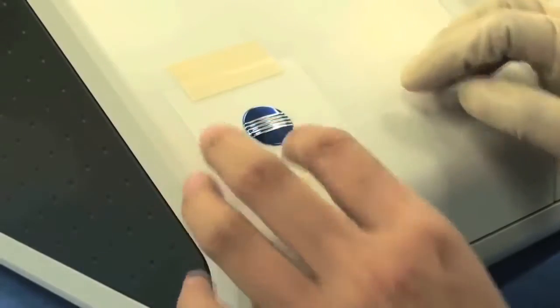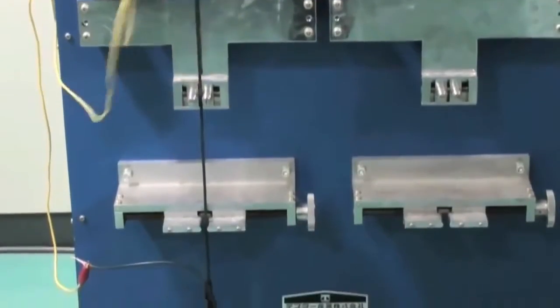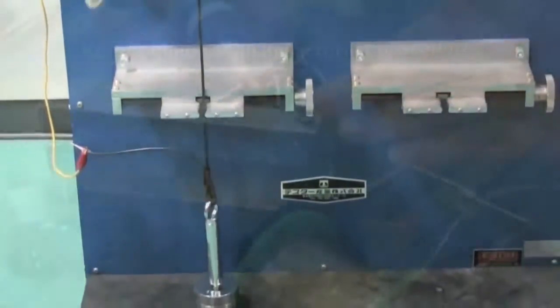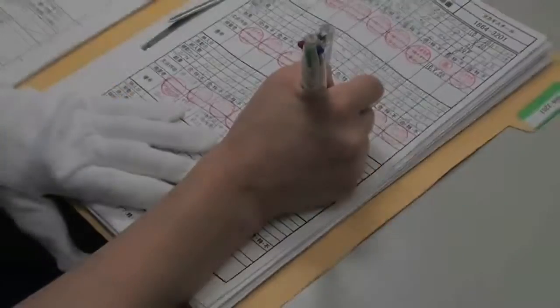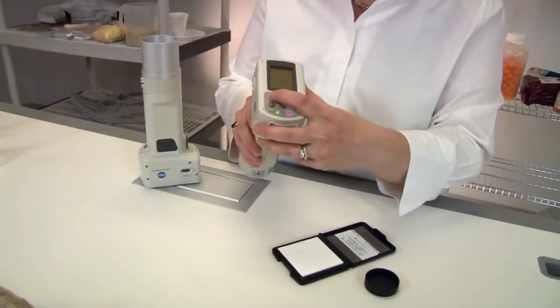Konica Minolta's CR400 and CR410 colorimeters are expertly designed to help improve color consistency and communication. Simply calibrate the instrument before measuring your product, present the sample, and press the measurement button.